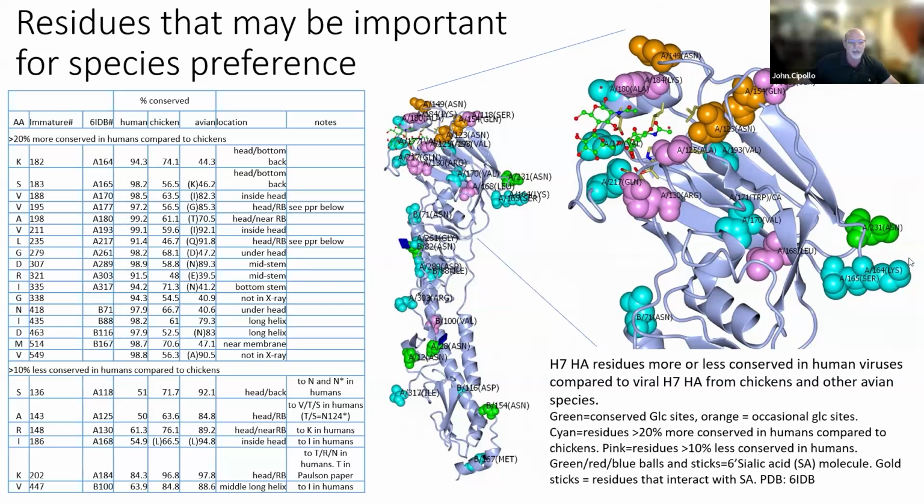So we'll do that. We're looking at H7. We're actually currently looking at H5. Why H7? Because looking through the data and periodic changes, H7 does seem to appear every 7 to 10 years. And last time it appeared was around 2015 to 2017. And it seems to be very busy in that mixing bowl right now.